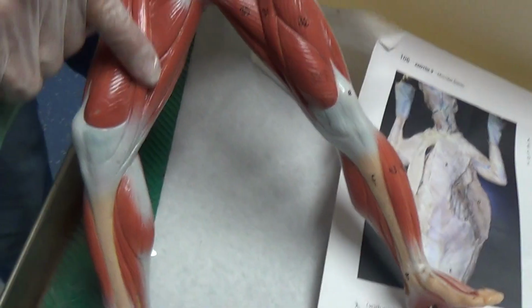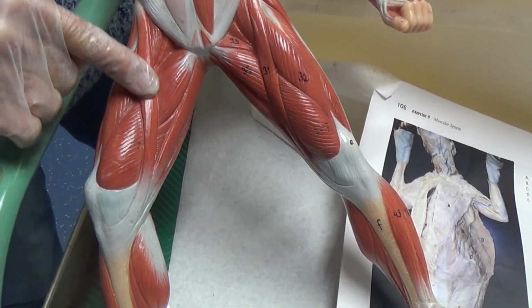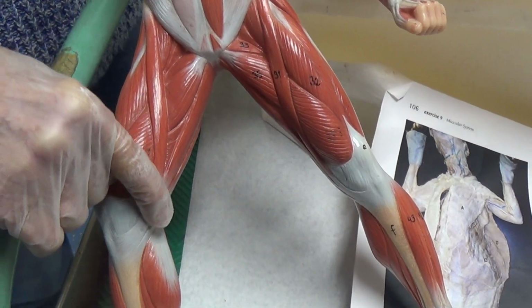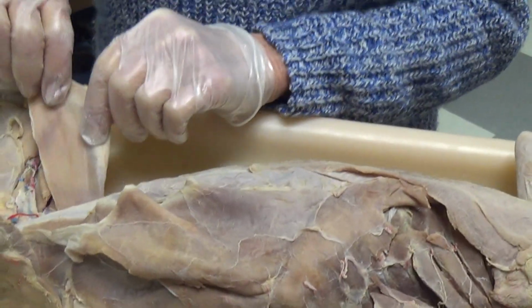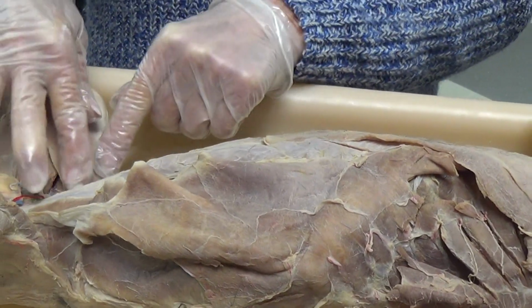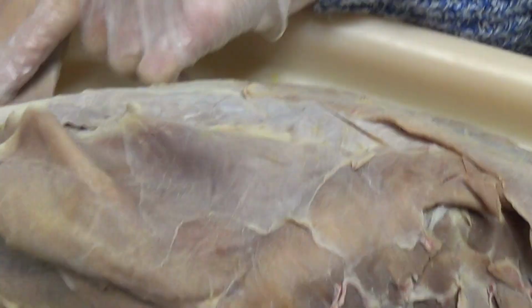Anytime you look at a photograph or a video of men running, this muscle is very obvious. It's so pretty. Gracilis. Now, remember, in the cat, it's just a sheet of muscle. And the cat is very much more flat.